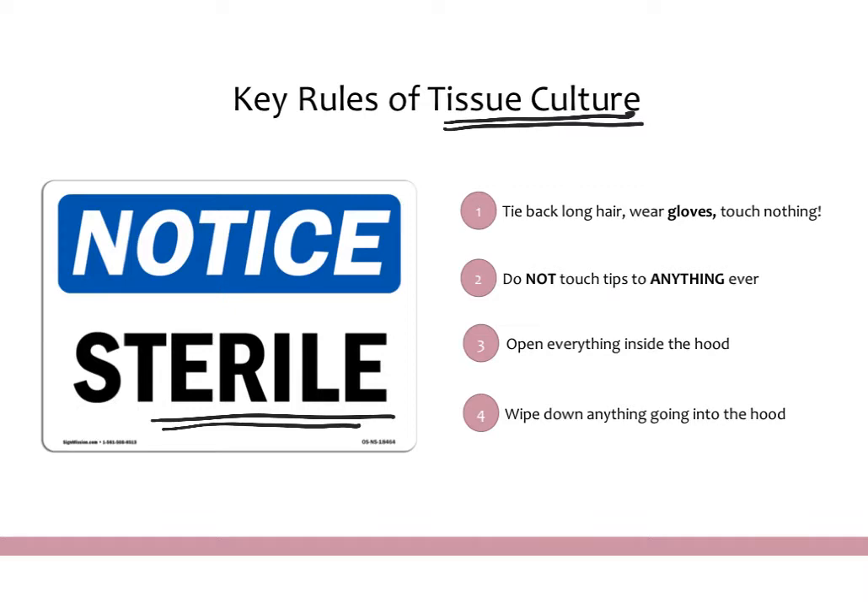That means things like protective equipment — gloves, white coats, tying back your hair, things like that. But it also means being really careful with what you touch and how you touch it and where you put your hands. The first thing to keep in mind, especially when you're new to the TC room, is to wear gloves from the second you enter the room to the second you leave. You don't want to touch anything, especially inside hoods or incubators, without gloves on.